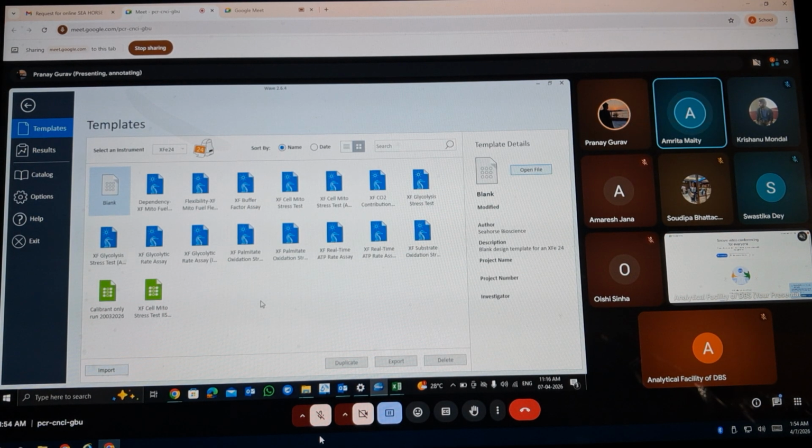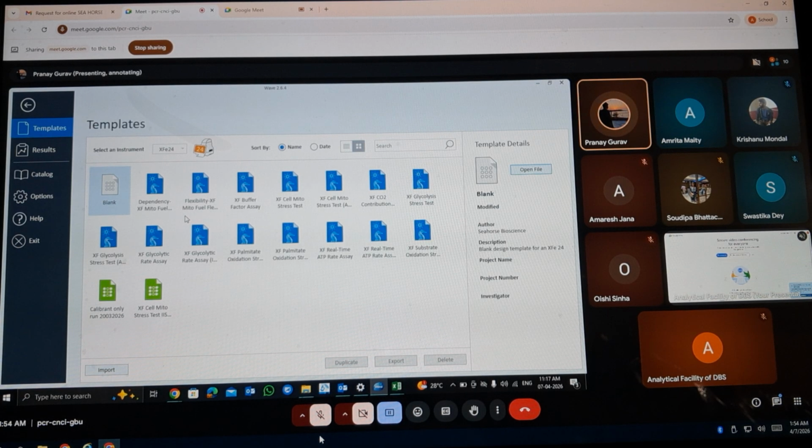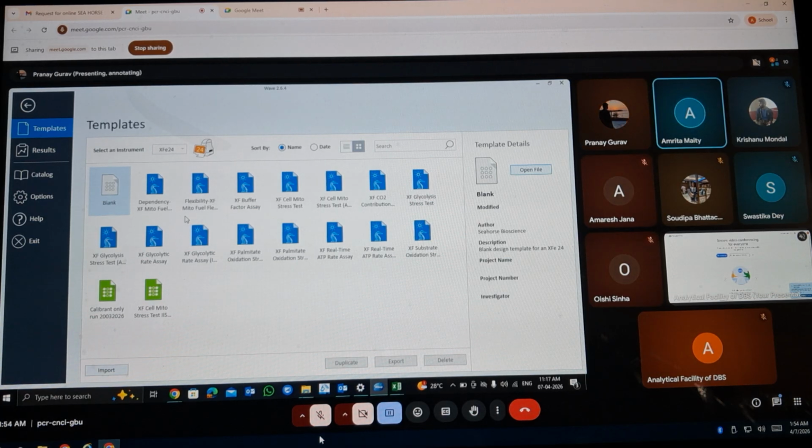So I can just take the data and manually calculate it, right? Here is basically the kit for calculating all those parameters. So the black experiment is not. I will get the kinetic measurements. Your kinetic measurements you will get. Yeah, that's what I'm saying. That's that raw data you will see. Okay.